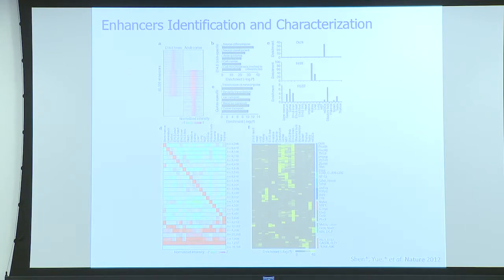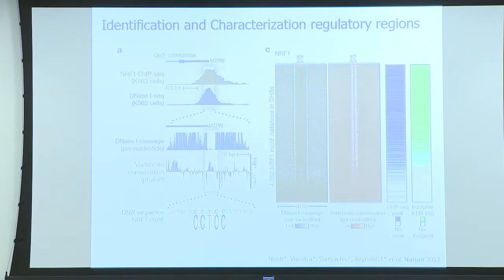And this is one of the beautiful powers of ChIP sequencing, that it allows us to identify and annotate genomic regions that were not amenable for this kind of identification before. That's again giving you some of the studies that were looking into enhancers and how they bind, and what is the exact motif that is identified, as Noam said, by a specific transcription factor.